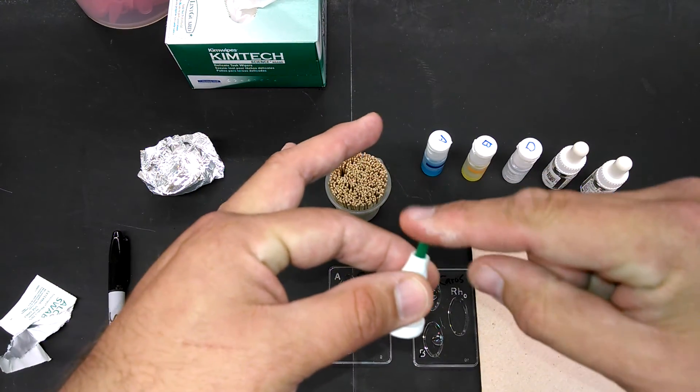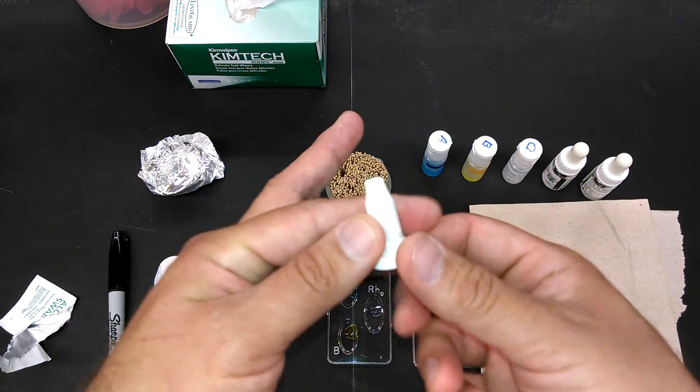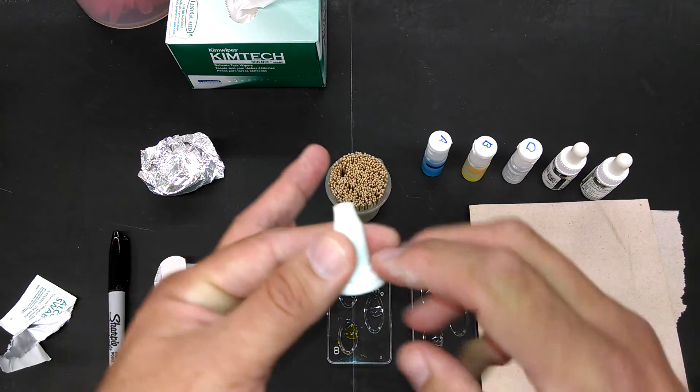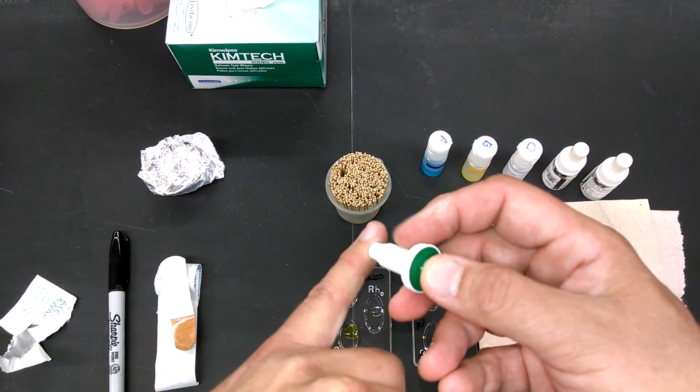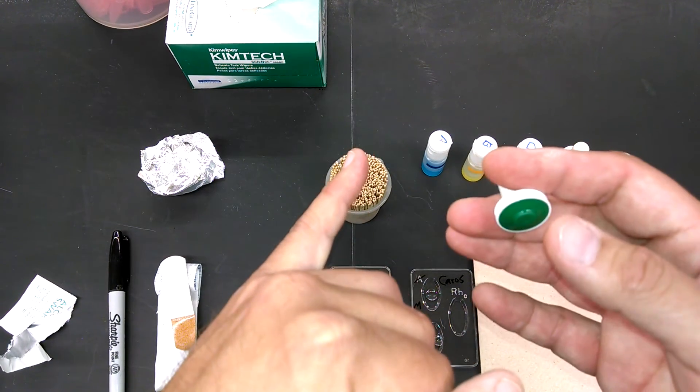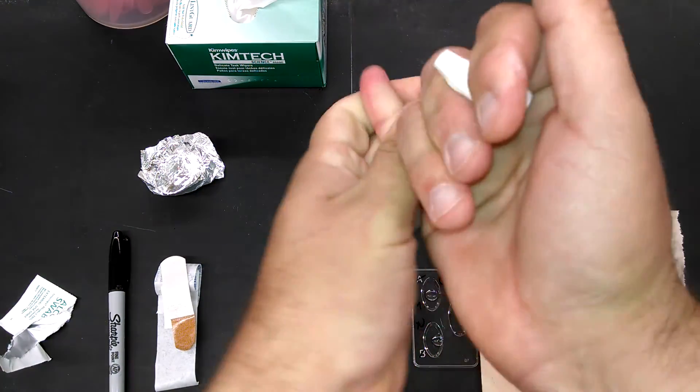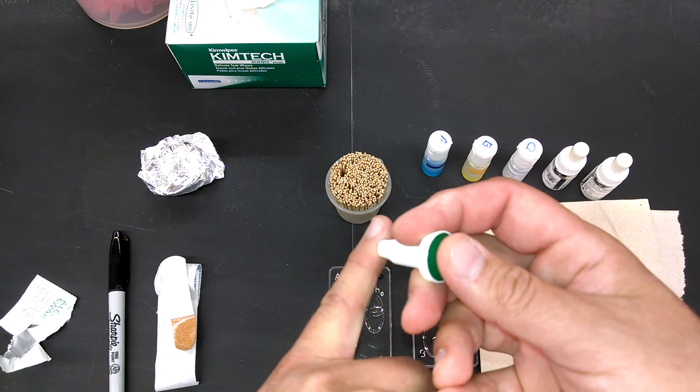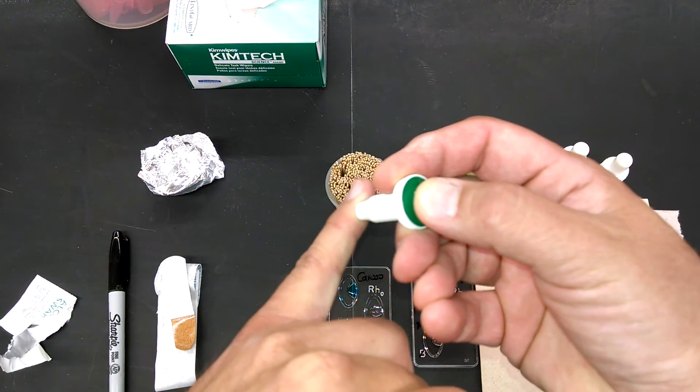The lancet, what you do is this green thing here is a protective cap. You just twist it off. It comes out. It's trash. The lancet is buried in here. It's a single-use thing. When you press this green button, it snaps out. So what you do is place it where you wish to draw blood. Now, if you are someone with cold hands, it's going to be tough to get blood. A good idea is to warm your hands up. Maybe even squeeze the area. Maybe even kind of milk a little bit of blood down there. Get some blood flow going. Press it to wherever you want to draw blood. Start screaming ahead of time. No, it's okay. It doesn't hurt. Press the button.